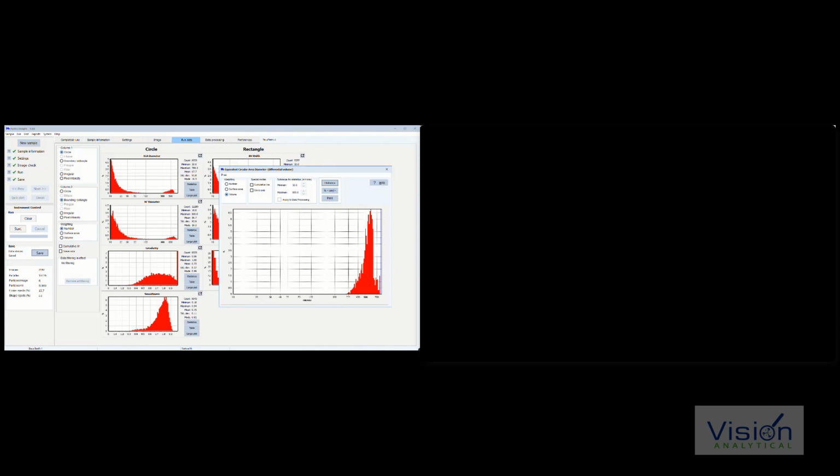What is interesting though is in laser diffraction there is no reporting of particles below the main peak. Whereas when you look at the number weighted distribution for image analysis, there are a larger number of particles in the smaller size range. Neither one is wrong. The reason is the volume weighted distribution, and the weak scattering intensity does not allow laser diffraction to see these particles. These particles are actually there.